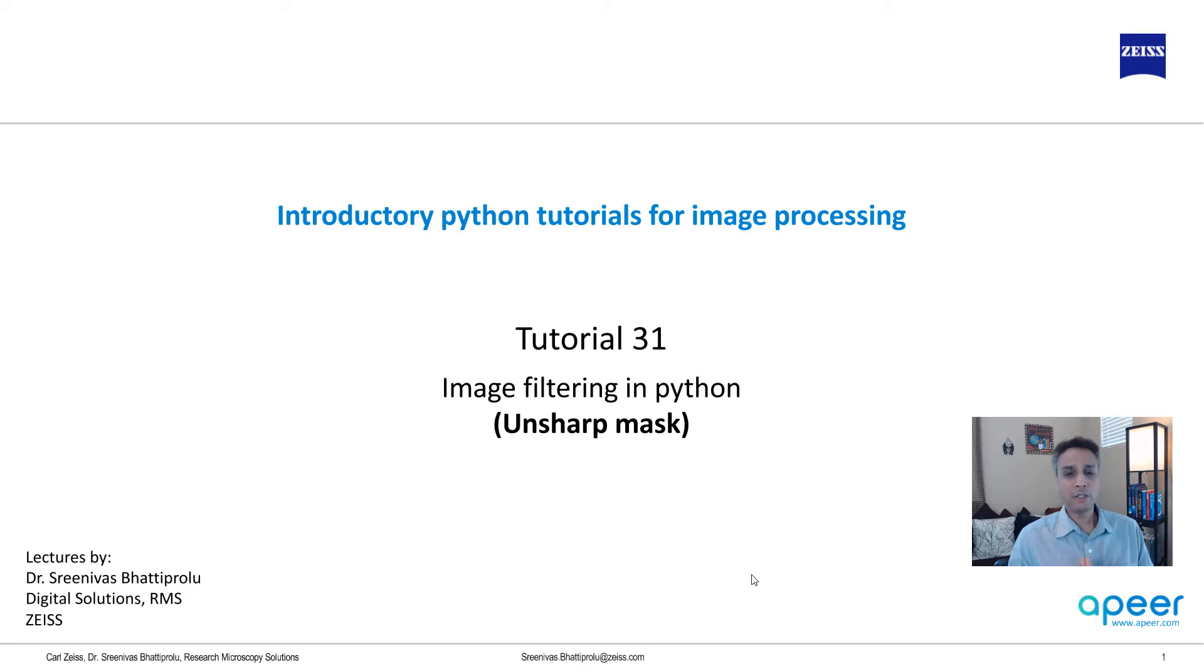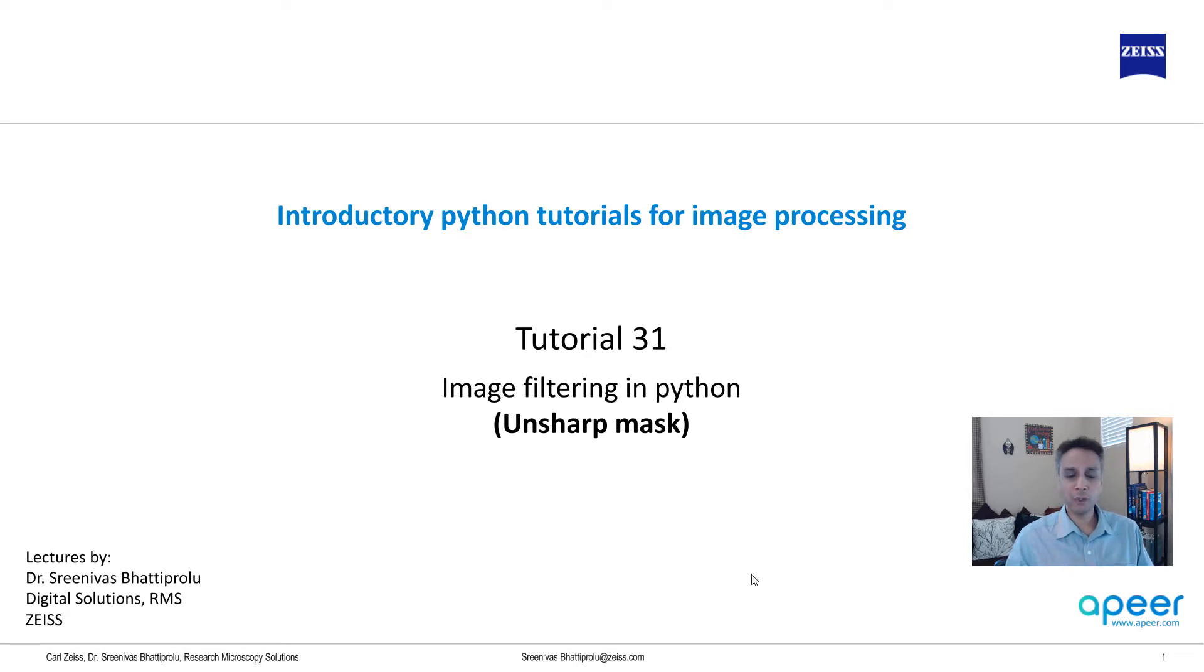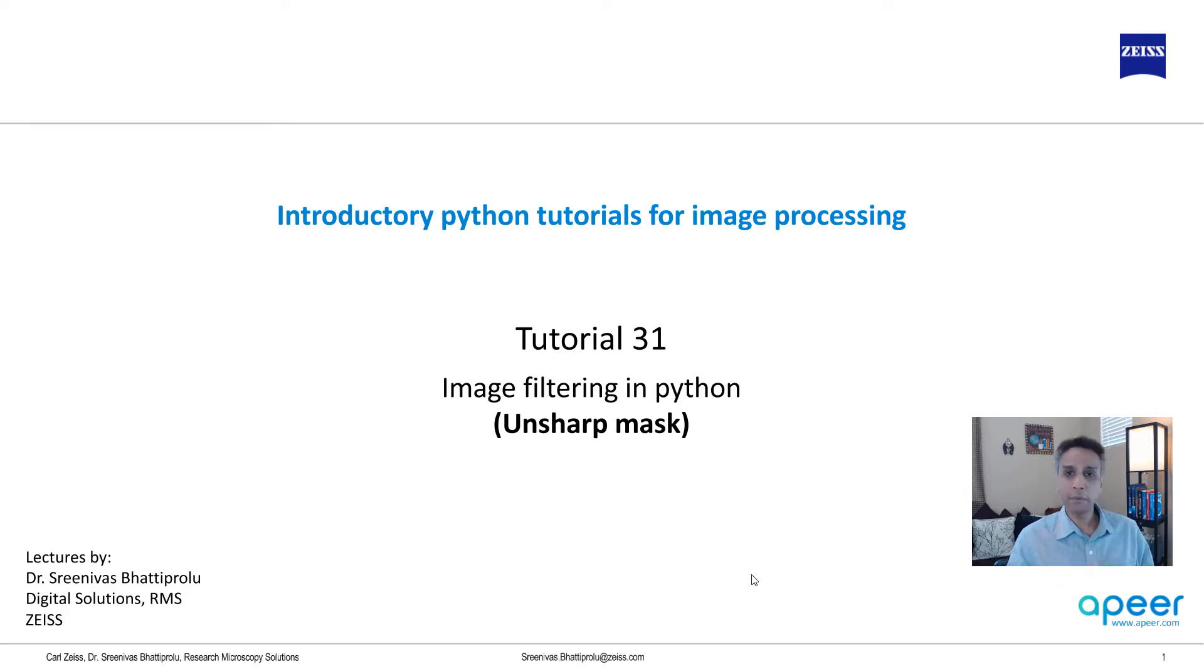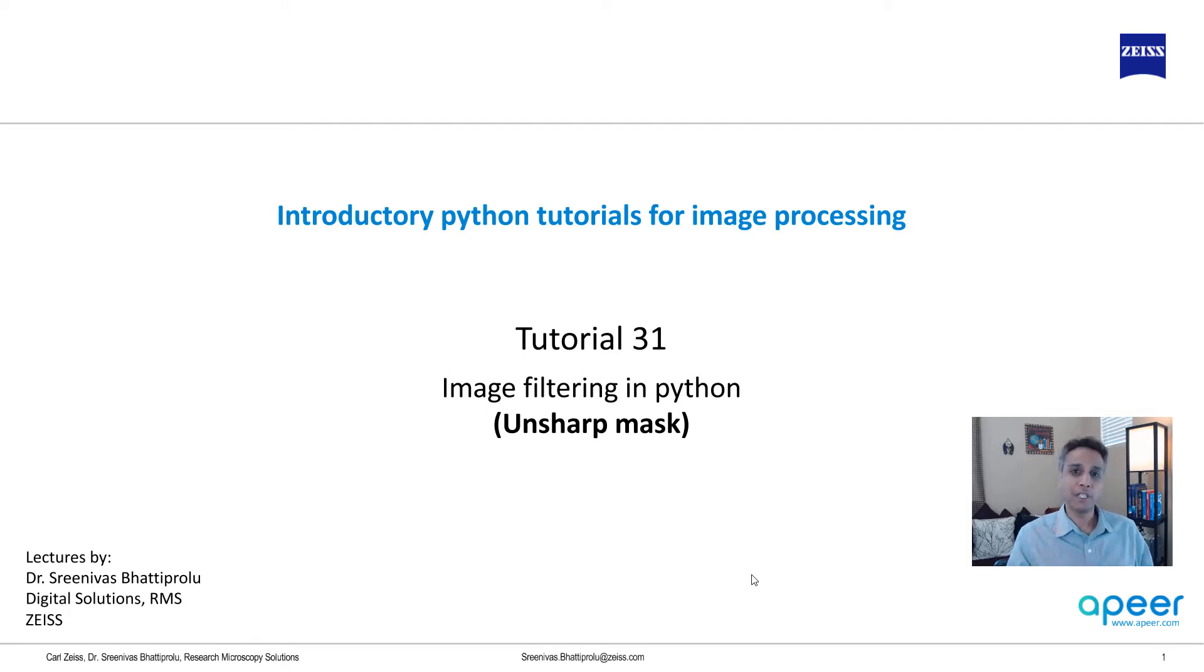In this tutorial I'm going to talk about unsharp mask and despite its name it's used for sharpening. I'm pretty sure you've used it as part of ImageJ or Zen. Let me quickly demonstrate it in Zen and then come back and talk about how it actually works, and then we'll finish this video off by implementing it in Python.